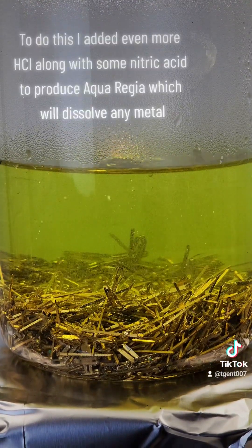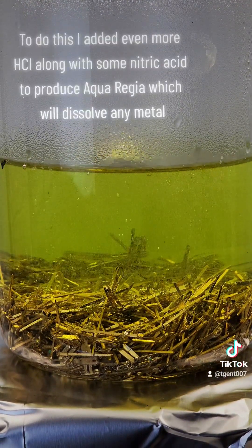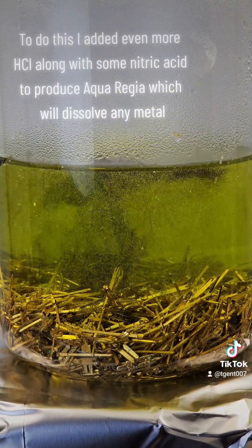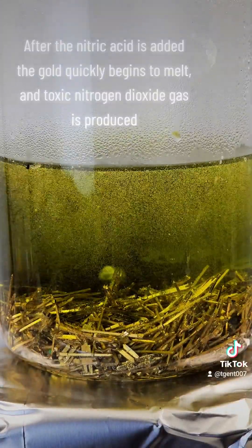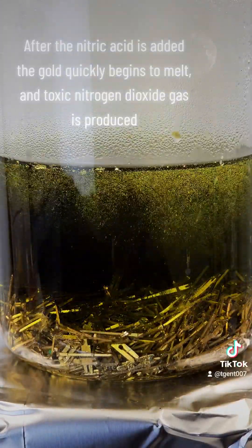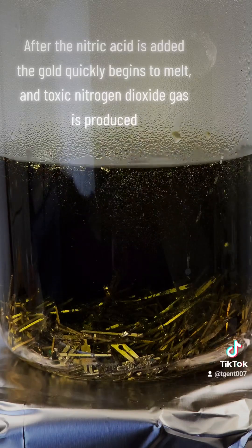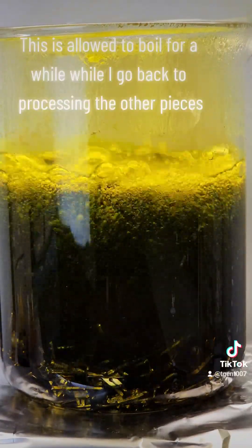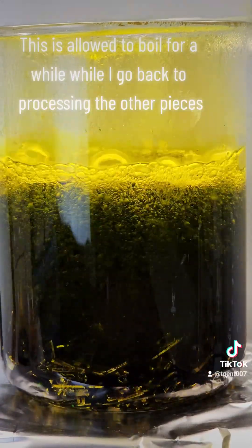To do this, I added even more HCl along with some nitric acid to produce aqua regia, which will dissolve any metal. After the nitric acid is added, the gold quickly begins to melt, and toxic nitrogen dioxide gas is produced. This is allowed to boil for a while while I go back to processing the other pieces.